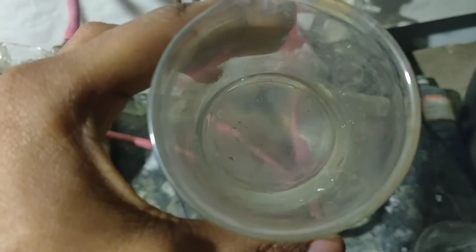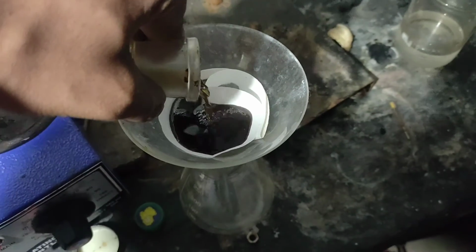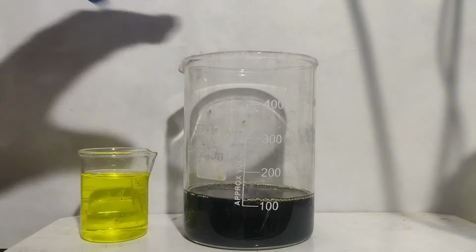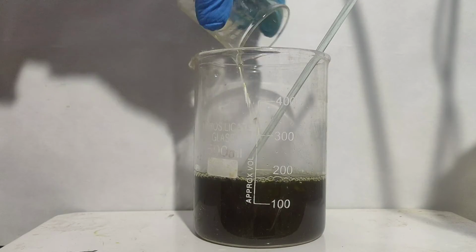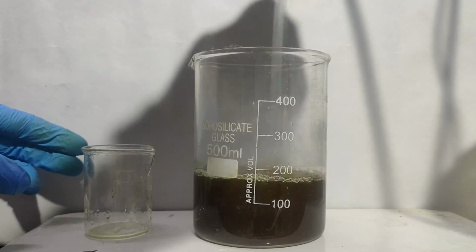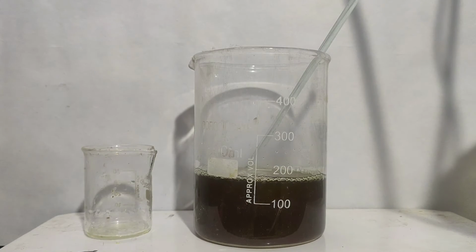But there wasn't any alpha nitronaphthalene in the distillate. Then the solution was filtered to remove any insoluble material, and then in a large beaker I took the filtrate and to it I added 40 ml of concentrated HCl. This produces a lot of sulfur dioxide, so it should be done with precaution and in a well ventilated area or in a fume hood.